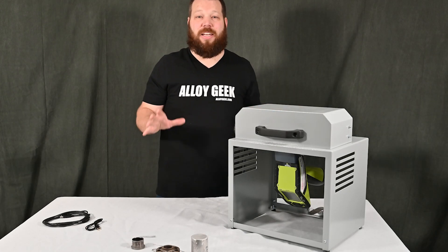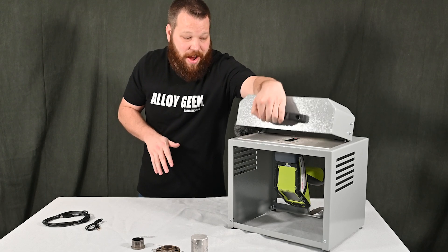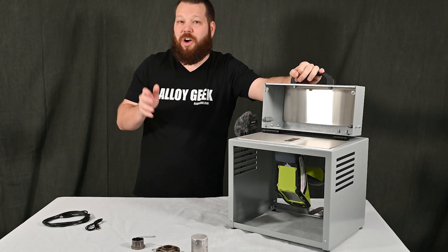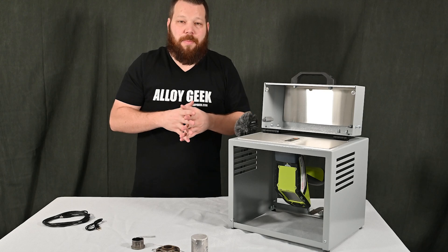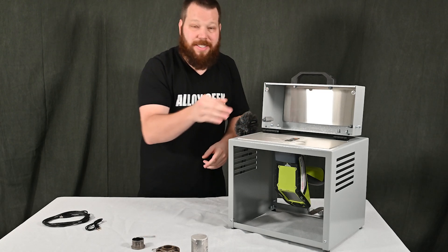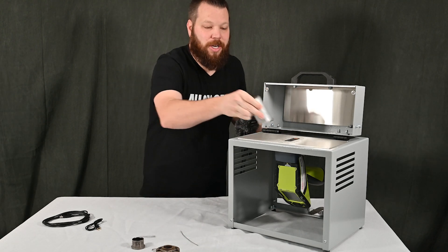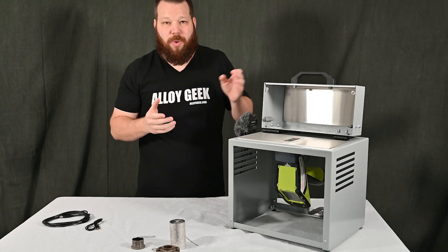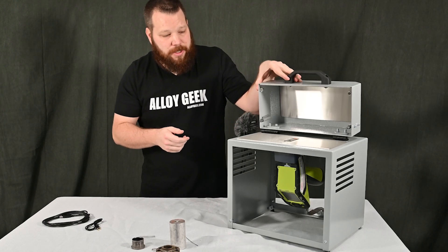Now we have the largest test stand available for the Niton XL2 and XL3T: the XL desktop test stand, available on AlloyGeek.com. It's actually designed to hold an entire gold bar — you can see how broad this sample surface is. It's great for large or awkward samples. If you're doing orthopedic joints — like a long awkward-looking hip joint — and you need to target specific regions for chemical analysis, you can do that really easily here. It also works well for weld wire, strip, or cropped ends from production where you need to ensure the sample is tall or long enough.